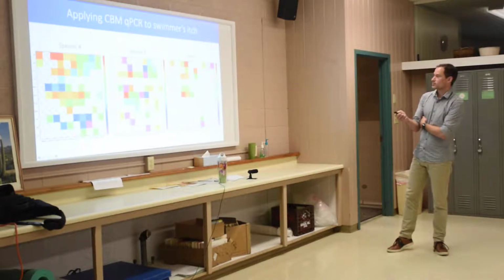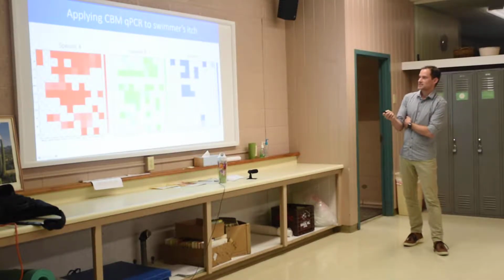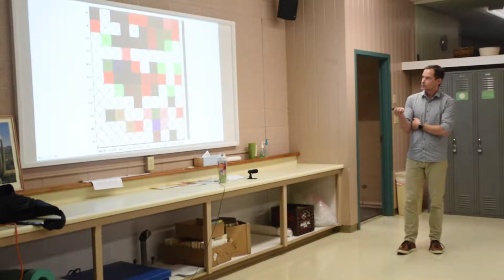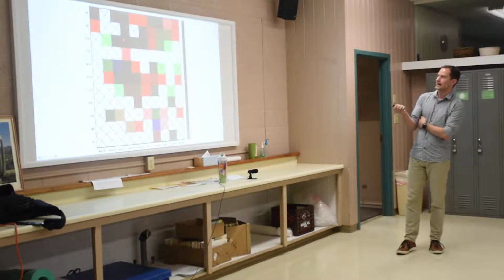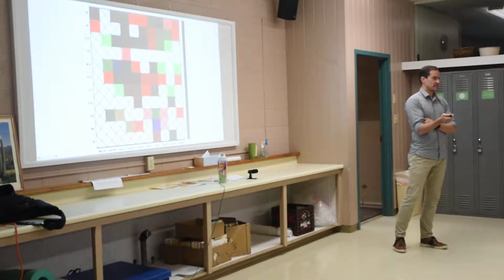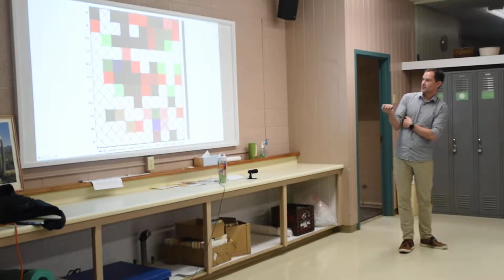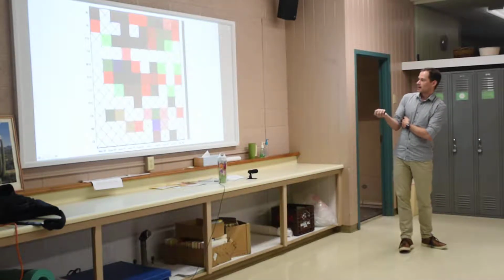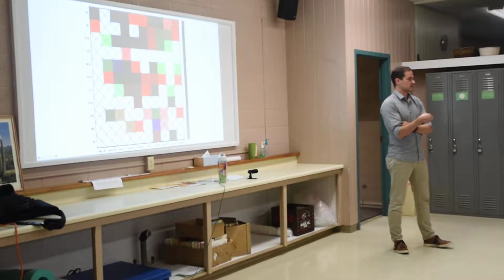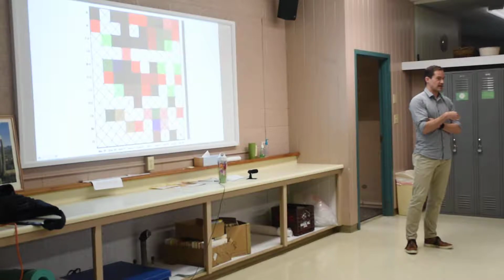That's pretty important. And if we take that same heat map and we just color code it based on the species and we merge them together, what you start seeing is that the locations that are black are places that have all of the parasite species, all 3, at that location. But if you have a color there, red or green or blue, which is the only place, then that means you actually will have only a single parasite species contributing to that location at that time point.